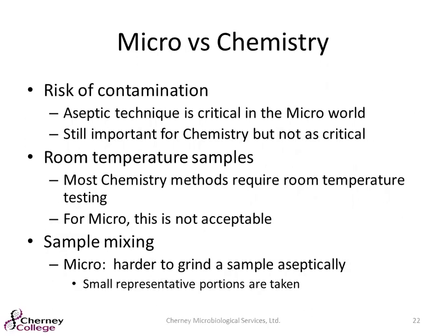Okay, so that is micro. Now I'm going to go on to just a couple of the more common chemistry tests. But the difference is, in a lot of internal labs you will probably have the same technician handling both samples, and the requirements of the aseptic technique are different between the two.